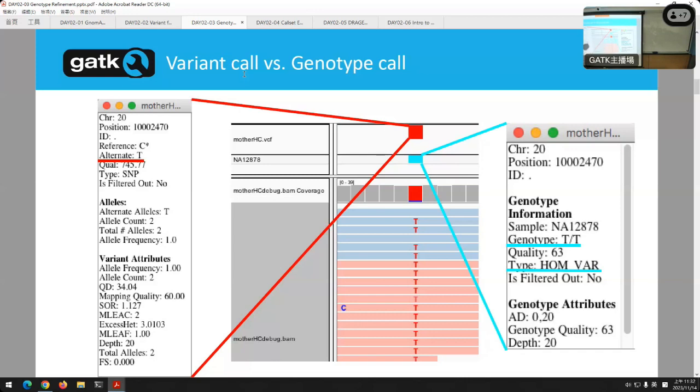Somatic mutation is a good answer. It could be contamination from another sample. Those are terrible things, but those are possible. There are many other reasons. The sequencing is imperfect. The alignment is not perfect. It could also be bacterial contamination. So there are many reasons you'd see something like this. It's not the variant caller's fault. It's doing the right thing. It sees it right there.